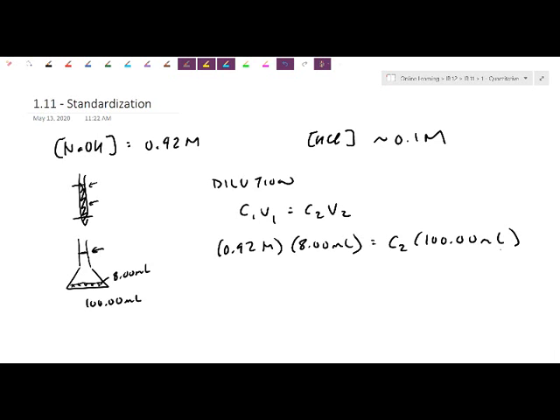For this one here, remember we said we just wanted consistent units. It would be nice if I actually had the error for this, but I'll just demonstrate the error for the next part of the calculation here. Let's just say this is a true 0.0736, so I'm just going to round it to 0.074 molar.